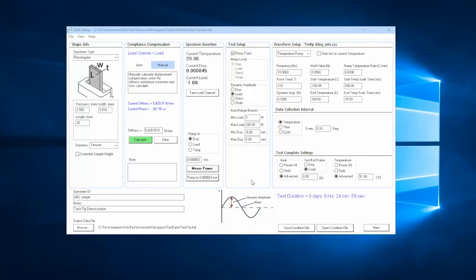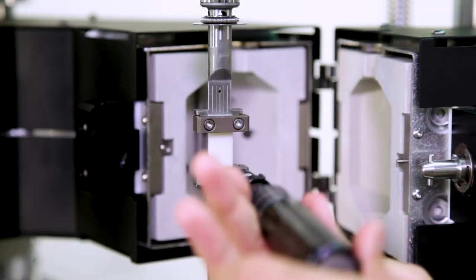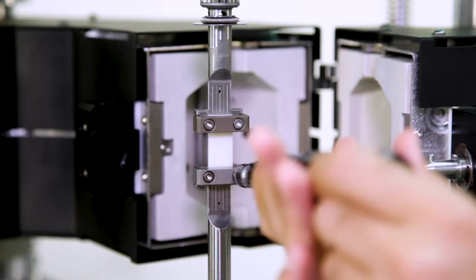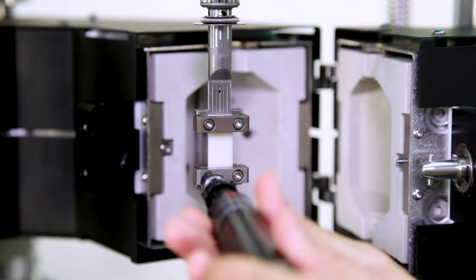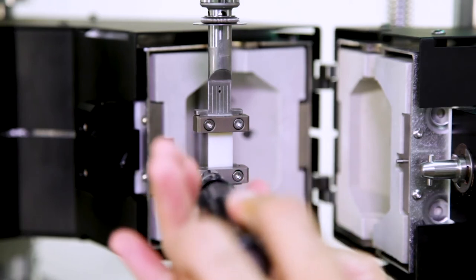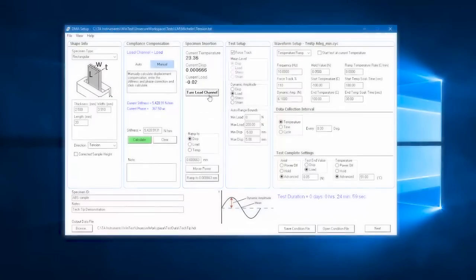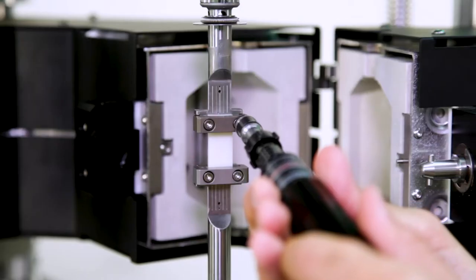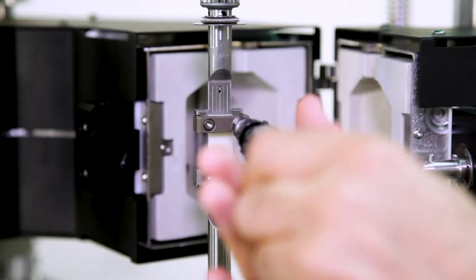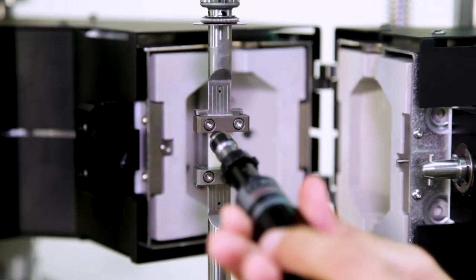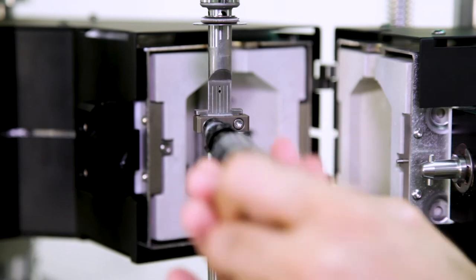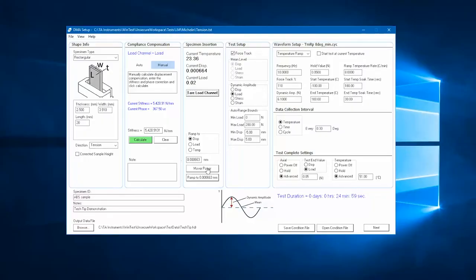To make sure we correctly eliminate this clamping load artifact, we can mount the sample onto the lower fixture first, tare the weight of the sample, tighten the upper clamp, followed by commanding a small tensile load.